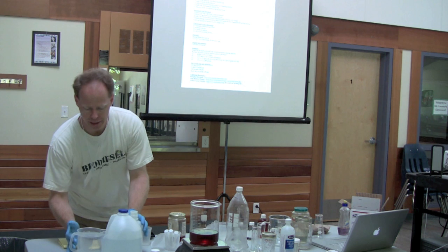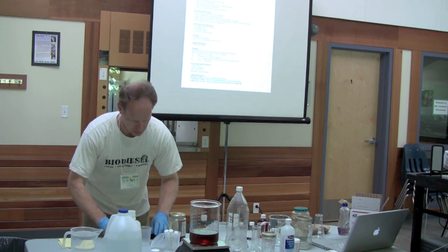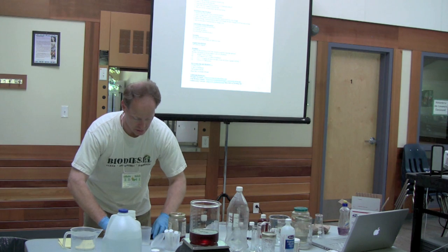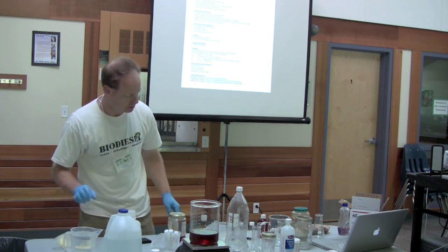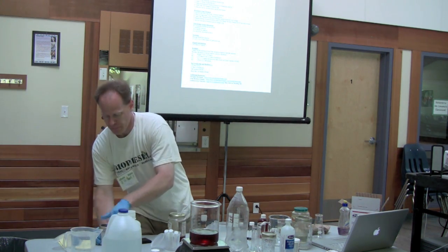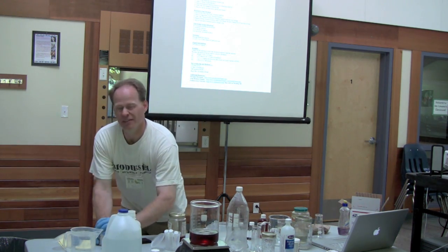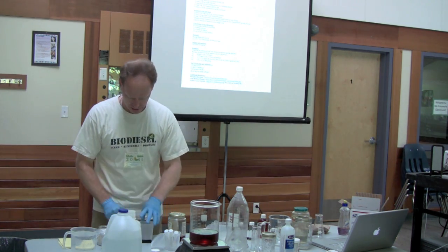Okay, so back to our titration solution. I've got 1 liter of water. And can I just say, I wish the United States would get with it and start using everything in liters. It's so much easier. Although I've got the conversion master, it's 3.785 liters to a gallon.